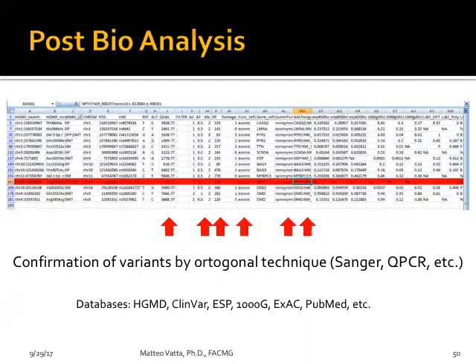So getting rid of Sanger is going to be hard. But other technologies have been utilized, like other massive parallel sequencing methods. Or sometimes, if there are recurrent changes that you detect, you can use a TaqMan probe or SNP array or whatever you want, depending on the application.